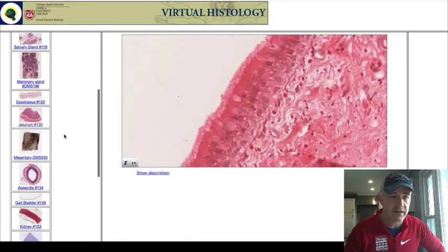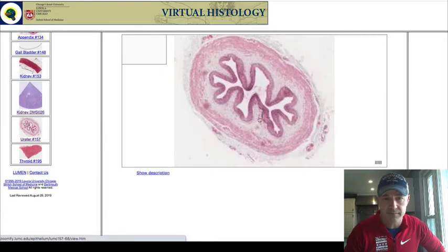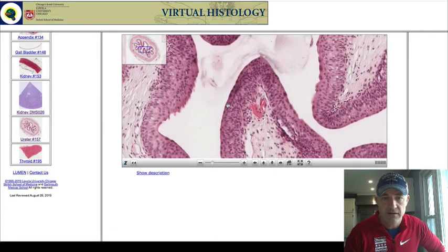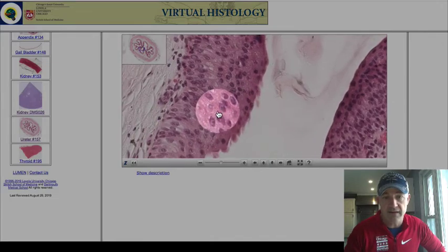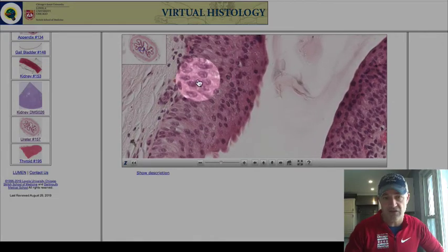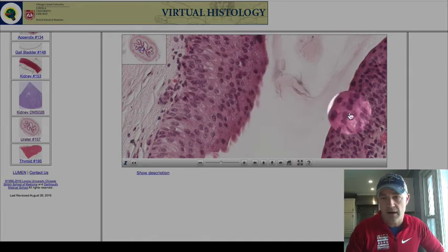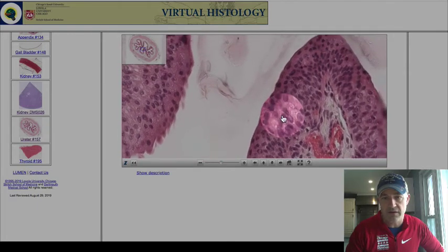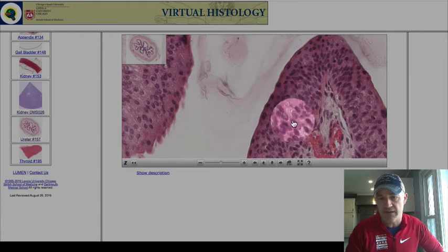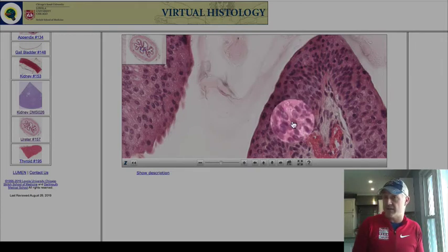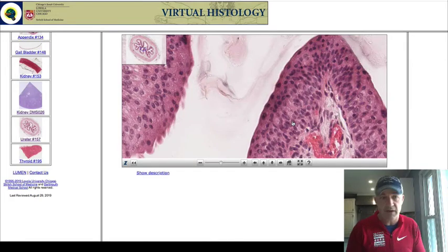The other specialized type is shown in the ureter slide. Zooming in on the surface — this is not distended — you can see transitional epithelium: multiple layers, with rounded cells at the surface. Looking at a cleaner area, you can see flatter cells toward the surface and more bubble-shaped cells deeper in. This is transitional epithelium, one of the stratified specialized types.